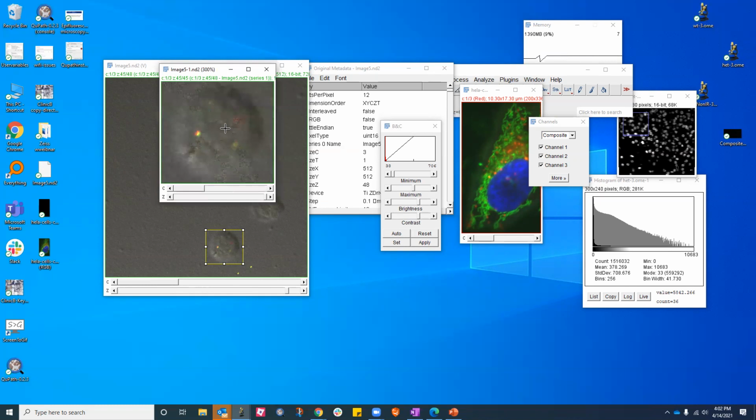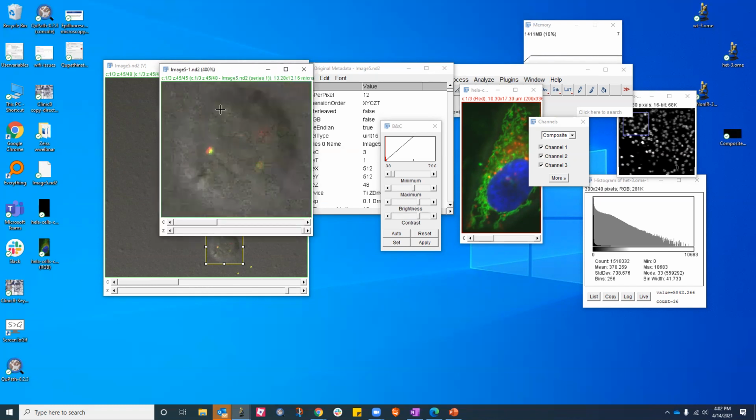I'm going to zoom in, and clearly you can see that things are getting pixelated, right? Because again, the image was small, we cropped it, so it's expected for it to get pixelated. Again, it was a 512 by 512 image, and I should have really imaged this at 1024 by 1024. Okay. So anyways, let's go back and look at all of this, right? We have got beautiful cells. Now we want to look at sort of a 3D projection, right?